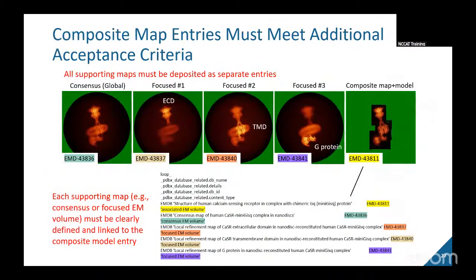While on the topic of file uploads and data sharing, I do want to talk about a growing challenge that we're seeing with EM depositions, which is batch submission. This is where you have a single study and you have a set of related structures. This is something that is extremely common. We already heard about it in the first talk this morning, in a way, how sometimes you're working with many maps. You have issues sometimes with modeling. I'll discuss this here in these slides.